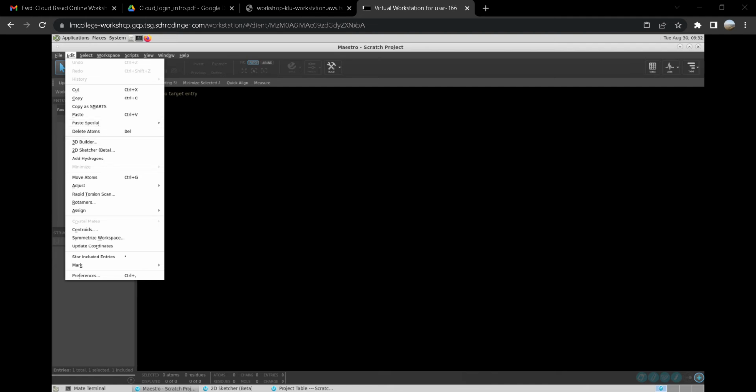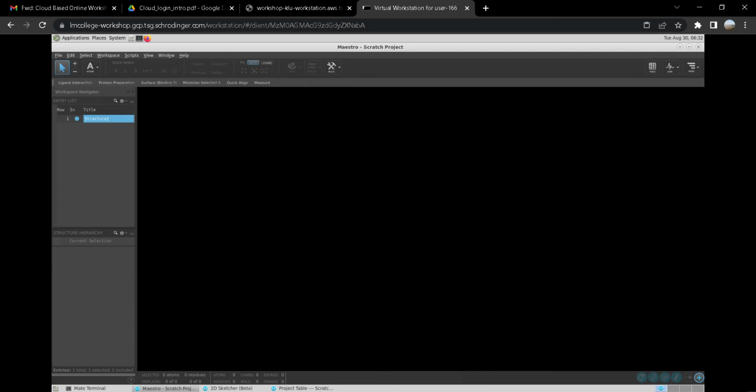That's a very nice question. Thank you, Nadeem, for bringing it up. This is the kind of question I want. If you can see my screen now, there is a More option. In More we have so many things. You can see organic, rings, heterocycles, so many things are there.